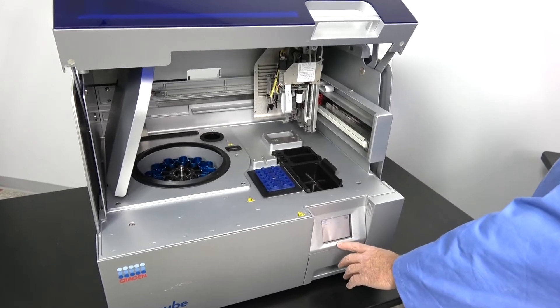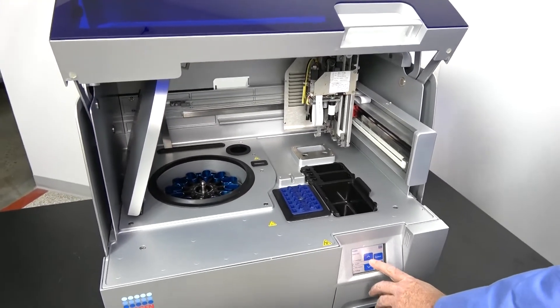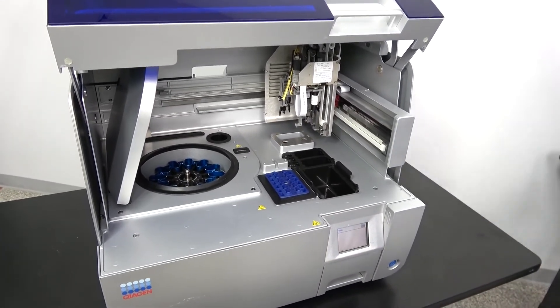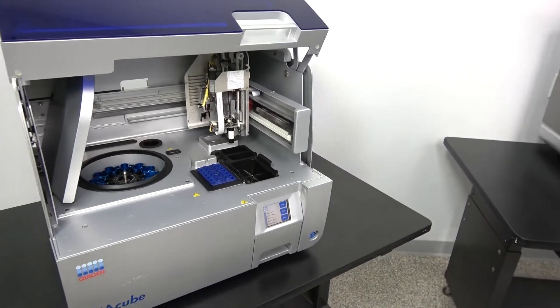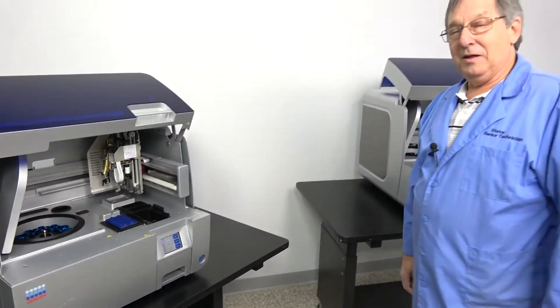The screen gives you more information than you could possibly ever need. We can test centrifuge and whatnot. These are all tested, these are fine working units, and they will be available shortly on our website. Thank you very much.